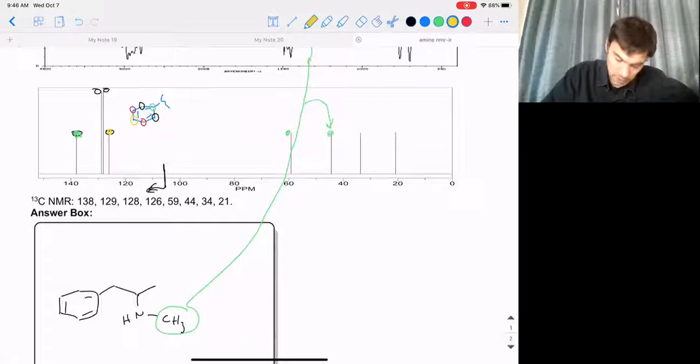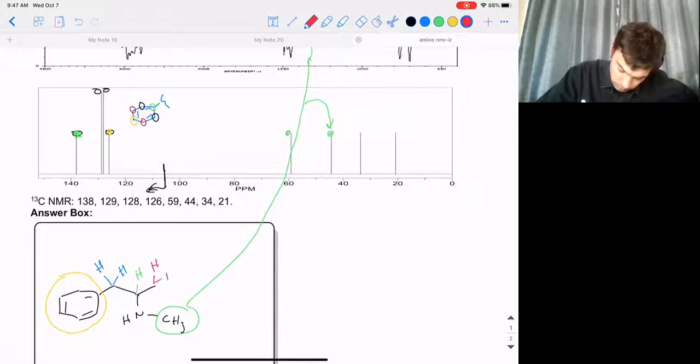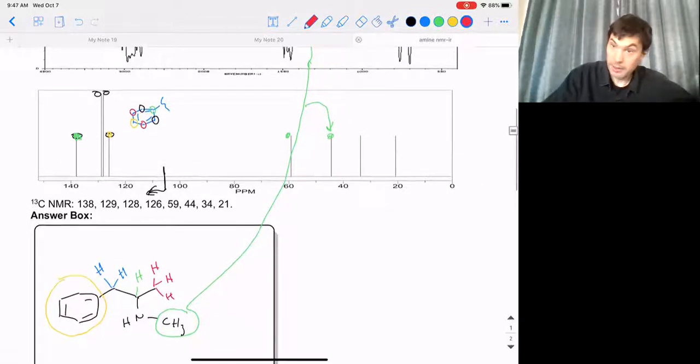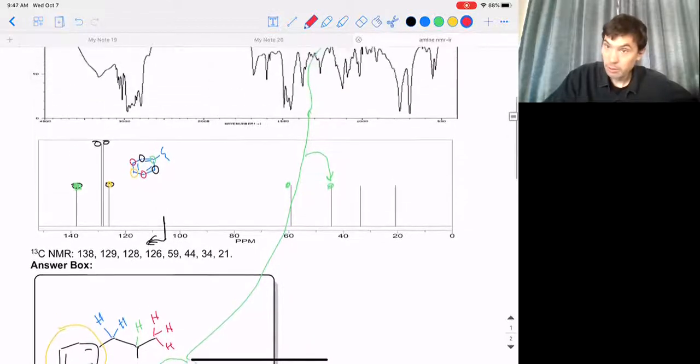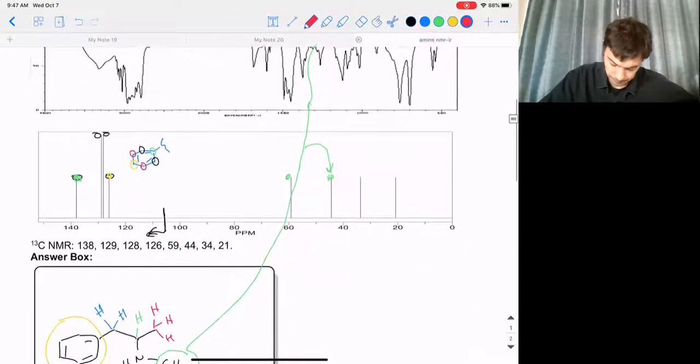And then we already have our phenyl blob that we talked about earlier. So at least we confirmed that a couple of times. And now let's just work our way through all of the hydrogens in the backbone here, just as a double check. Okay, and so the red methyl group has to be a doublet, and it should be really, really upfield. And so indeed we have that here. We have a doublet for 3 hydrogens, and it is going to be split again into that doublet. And not only that, it's going to be right around 1 part per million. And so that's perfect.